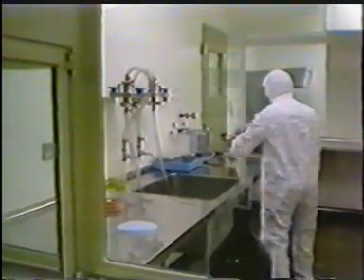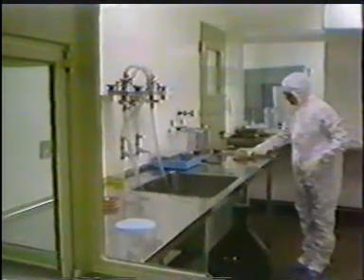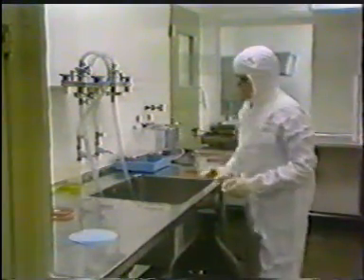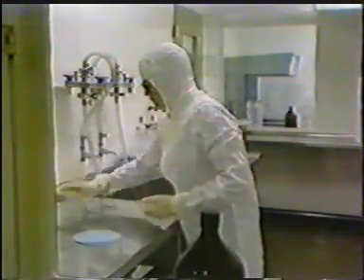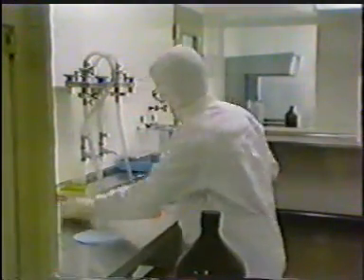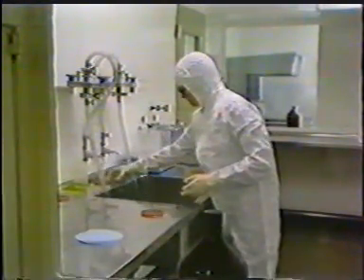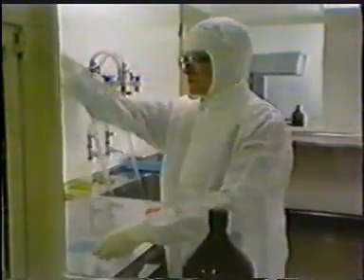Normally, settle plating is carried out on a weekly basis, although the day and time may be varied. Plates are also exposed each time aseptic manufacturing is carried out. Expected contamination levels vary from one location to another, and levels which are acceptable in a preparation room, for example, may not be satisfactory for a laminar airflow cabinet. It is usual to monitor a particular unit for a number of weeks before deciding what level of contamination may be accepted in each position.